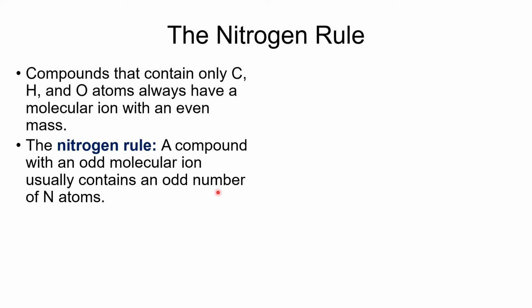If you go back and look at our rules in chapter 10, I believe, when we talked about calculating degrees of unsaturation, remember that if there was a nitrogen, then the actual number was going to be an odd number, because we had to add 1 for each nitrogen. That's just because nitrogen is trivalent instead of tetravalent, and it ends up giving us odd numbers when we have odd numbers of nitrogen.